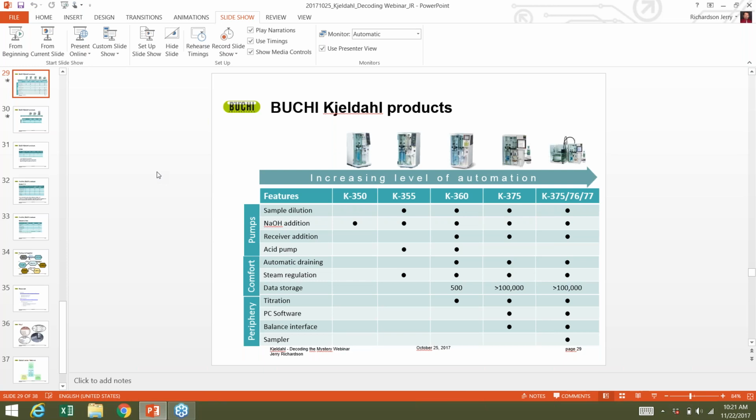I'm sorry, looking for beginning with a start point titration. It doesn't necessarily have to have the color change because the indicator is really not a part if you're dealing with a potentiometric sensor. On the other hand, there are people that I work with that do standardize their acid to 4.65, their boric acid receiving solution, that is. And so it starts off with a little bit of the brown color, and then anything that they do turns it to gray to a bluish color.